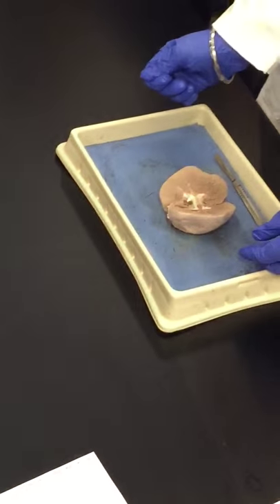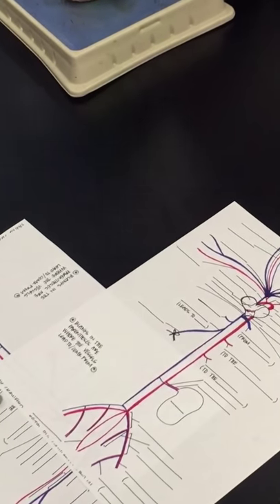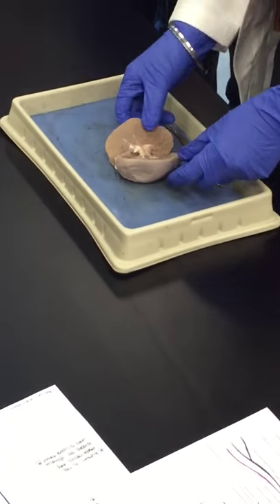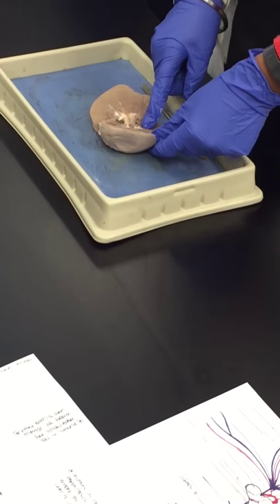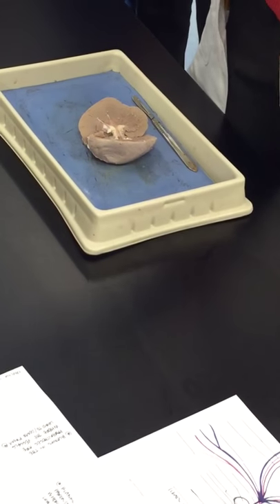When I cut open the kidney, I have this outer layer - the kidney is divided into two layers. Cortex and medulla: the outer cortex and the inner medulla.